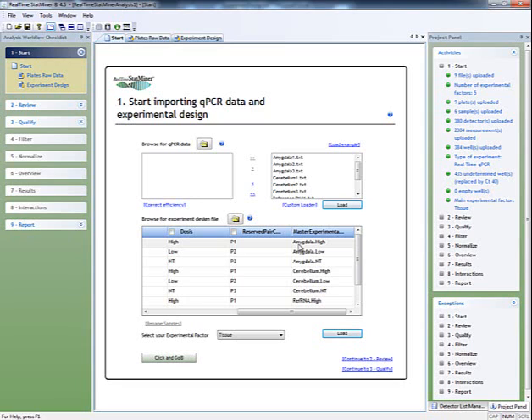Anyway, we can select any of those factors to define our analysis, but it is important to know that our results will be affected in different ways depending on the defining factor, and not only in terms of groups that we can compare at differential expression steps. Biological groups and distribution affect the imputation of missing values and best endogenous control selection, but also, in general, all quality tests applied to the analysis, such as biological outlier detection, amplification flags, etc.